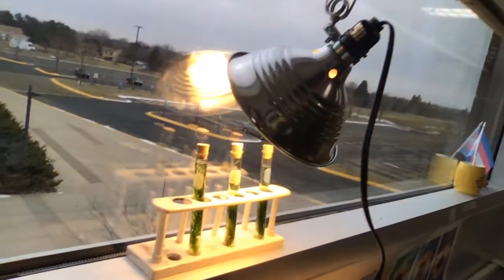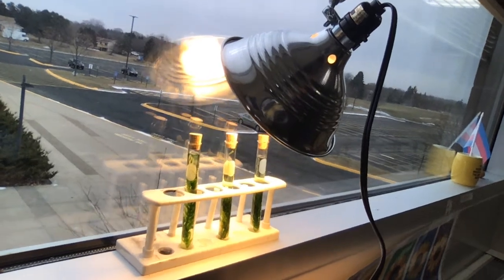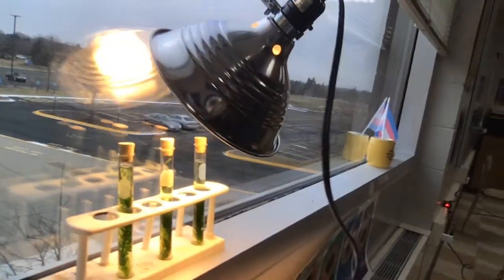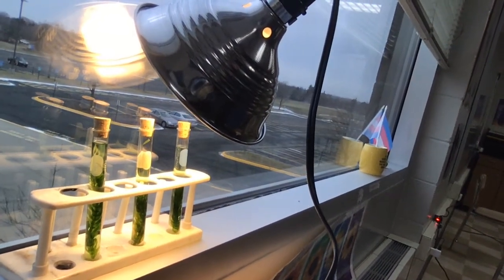Okay, guys, I had to move our plants because I don't have power in my lab at the moment. I'm not sure why I don't have power. So I moved the plants and I added some stoppers to them so that none of the gas would escape. So the plants now are right there. You can see the high school parking lot. And I added a lamp because it's a cloudy day outside. And so I don't know if they're going to get enough light for us to be able to see them change color well. But we'll let them go and I'll keep coming back.